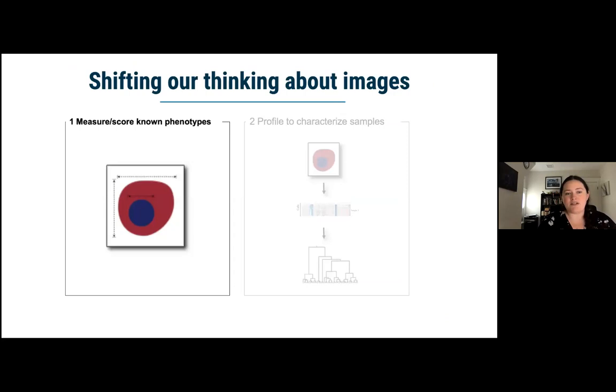And so, like I said, I'm first going to talk about some basic ideas of how to set up a high content analysis, particularly around measuring and scoring known phenotypes, which is the kind of science that most people think about and most people do.